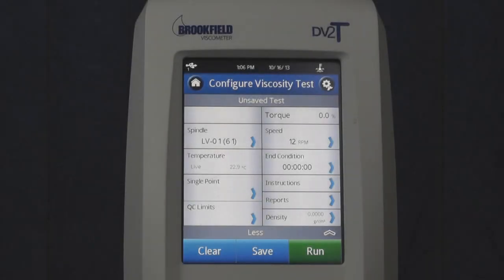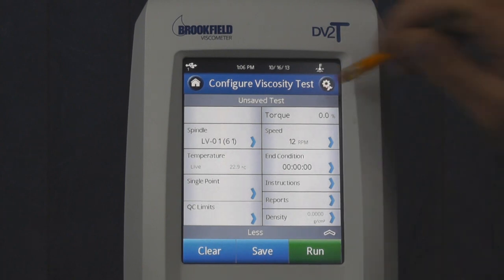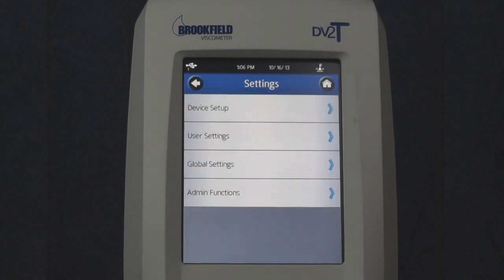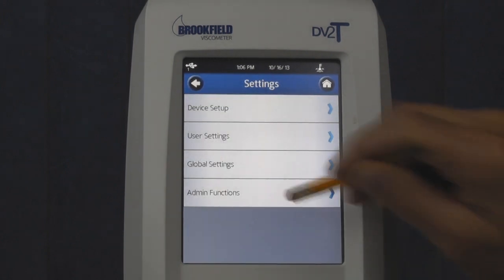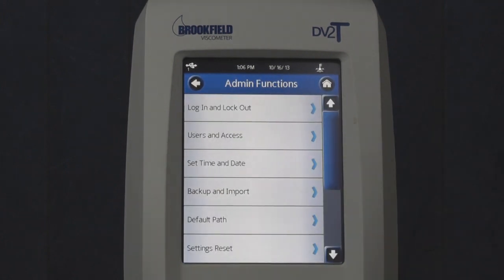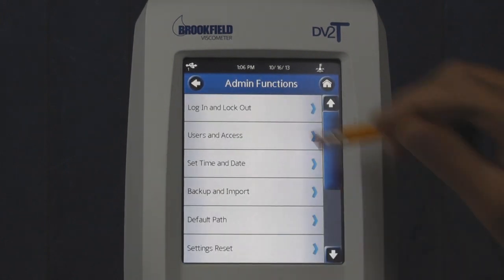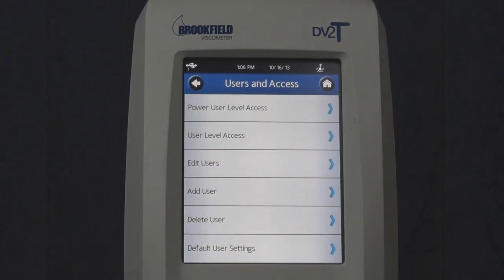As Administrator, you're able to add new users to the instrument. In the Configure Viscosity Test screen, touch the Settings icon in the top right-hand corner of the screen, then Admin Functions, Users and Access, and Add User.